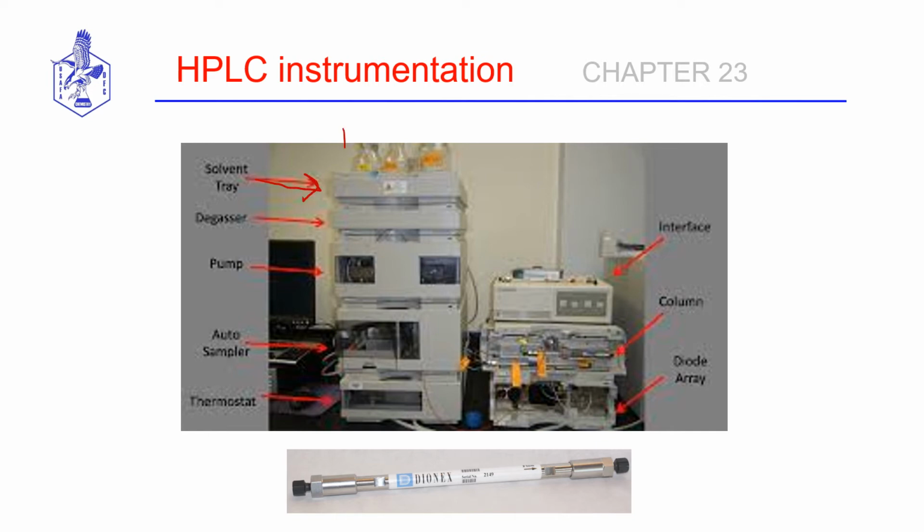So you see the bottles of different solvents that can be used in combination. Typically, there's usually 4 bottles available. As you've seen, oftentimes we like to combine 3 different solvents as our mobile phase, and the other bottle oftentimes is used for a buffer.